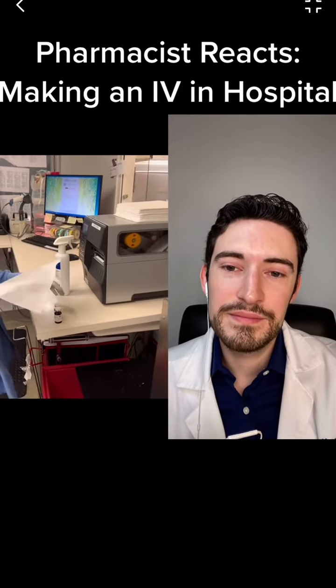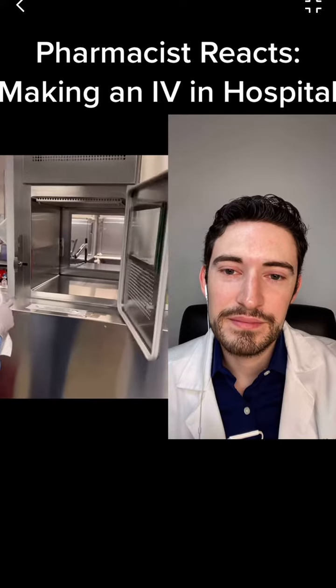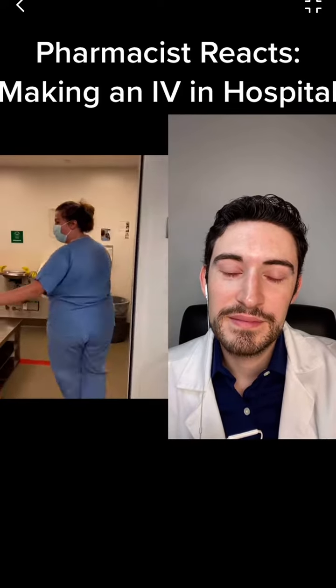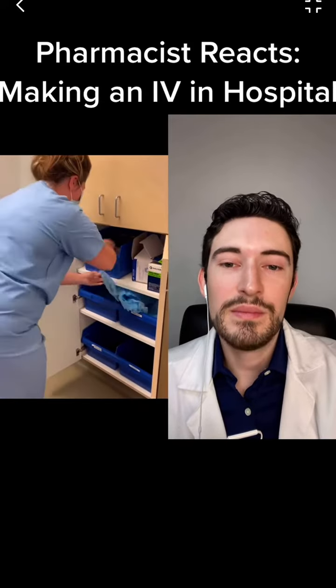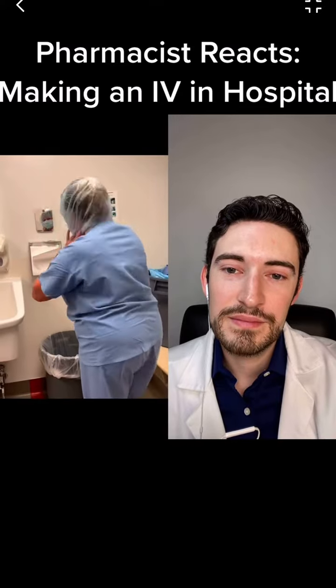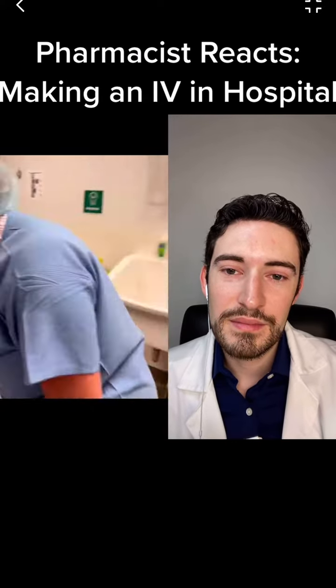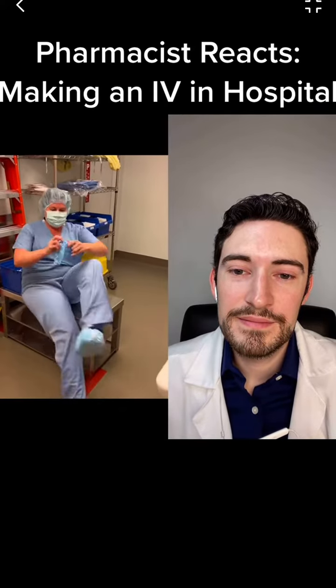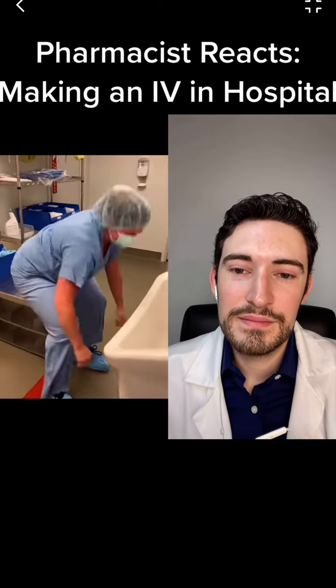Go ahead and pass them into the clean room after they've been wiped down with alcohol, so they're nice and sterile. Then we have the tech who's going to be making the order. That's me. I'm going to go ahead and put on a new mask as well as a hair net, making sure to get all my hair into the net. I'm going to put on some fresh booties, only putting my clean booty on the clean side of the line.